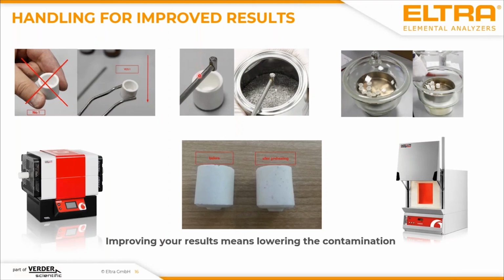Rule number 2 is use accelerators, moderators. On the next slide, I will go more in detail with this. And then we have a third rule. This is also if you want to measure very low concentrations, then preheat the crucibles before using them. This is a ceramic, and all ceramics tend to absorb CO2 from the air inside their structure. And this CO2 you can get easily rid of if you preheat the crucibles in a furnace.